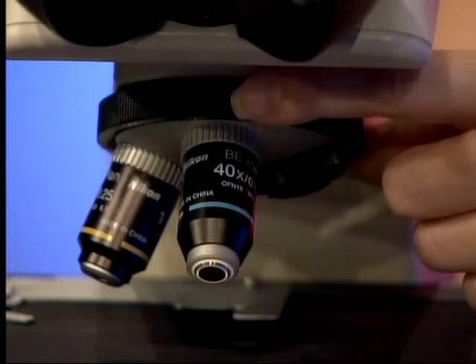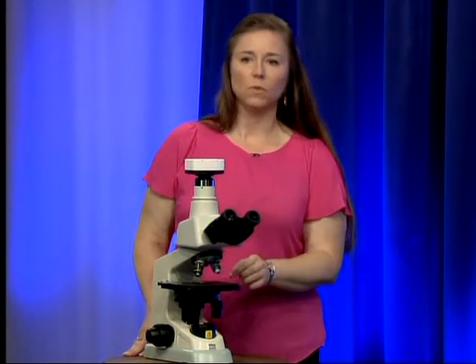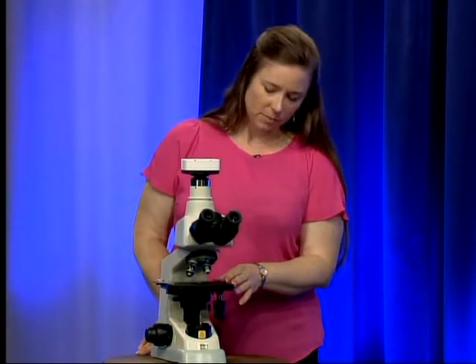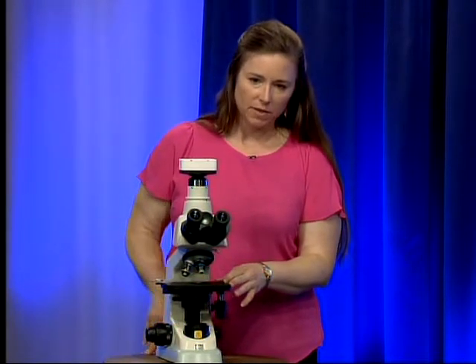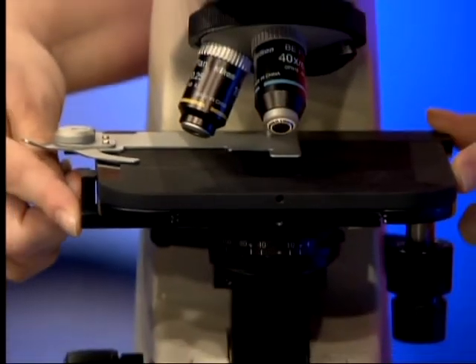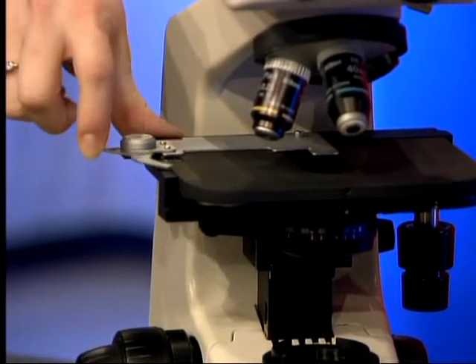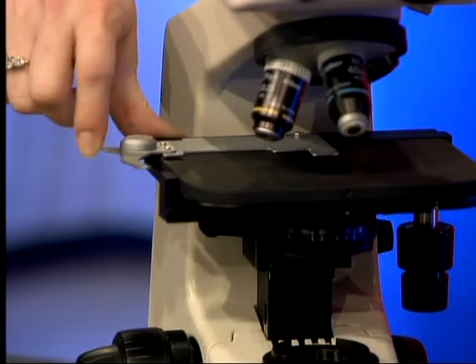The objectives are the most expensive part of the microscope. Right underneath the objectives we have the stage, and on the stage we have the slide holder. This is spring-loaded and it holds your slide onto the stage.